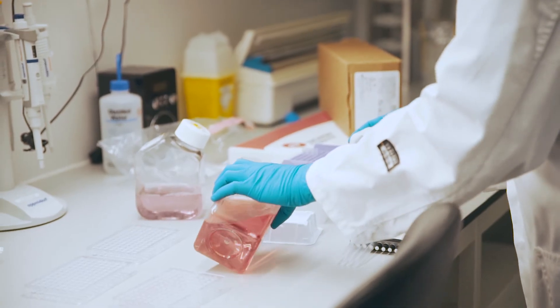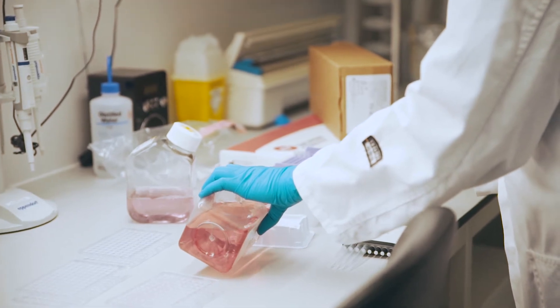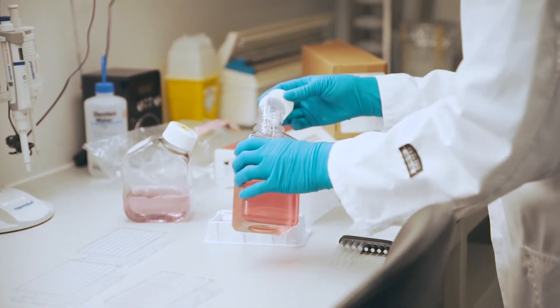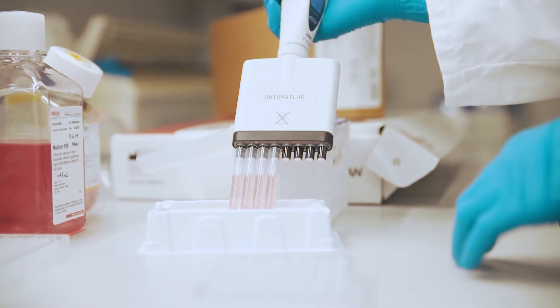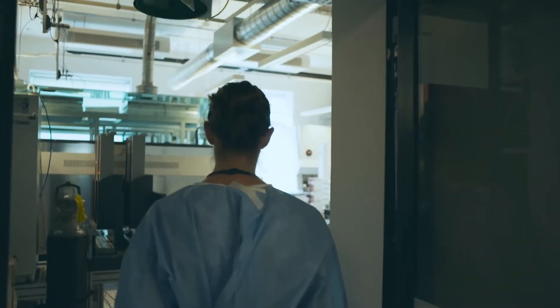Over the years, the cell culture technology has come a long way. Nevertheless, as your throughput increases, there is only so much you can do manually, especially when you have limited staff.